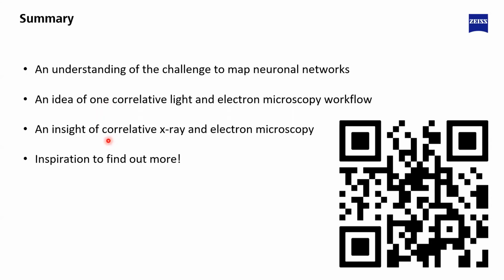And lastly, I went into a very specific challenge that I faced also during my PhD and still now at SAIS, and that is finding the right volume of interest in my data set, in my tissue that I prepared for electron microscopy, and am able to tackle that with correlating X-ray microscopy with eventually the electron microscope data that I'm acquiring. And with that, I hope you enjoyed the talk.